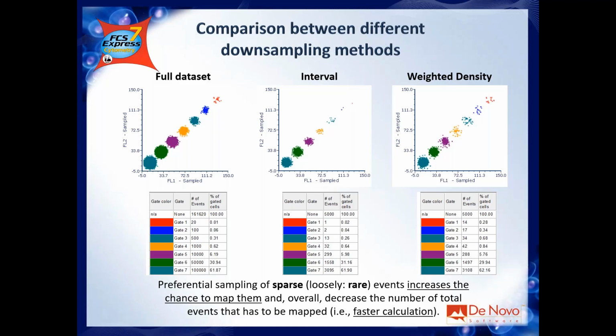If you're running tSNE, you increase the chance to have an island for those two, blue and red. If you're running FlowSOM or k-means or SPADE, you are increasing the chance to consider them as 2 separated populations.